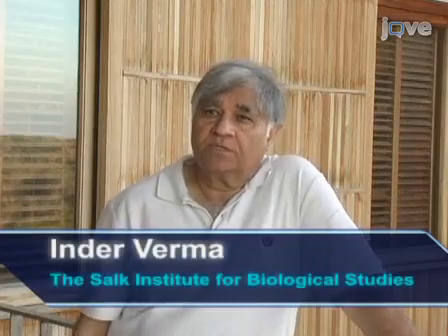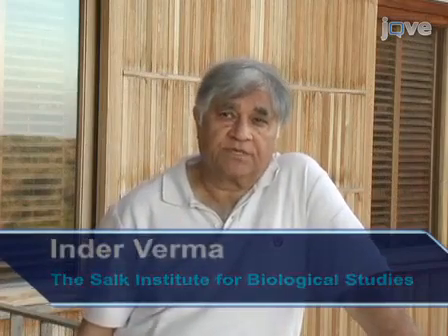The main advantage of cerebellar slice cultures is that it allows the study of the cerebellum in its original structure, unlike primary dissociated cultures where the neuronal networks and cellular organizations are disrupted. So this method will allow one to answer some key questions in neurosciences, especially because one has the wild type and the mutant mouse, so one can study comparative development, physiology, electrophysiology and pharmacology.